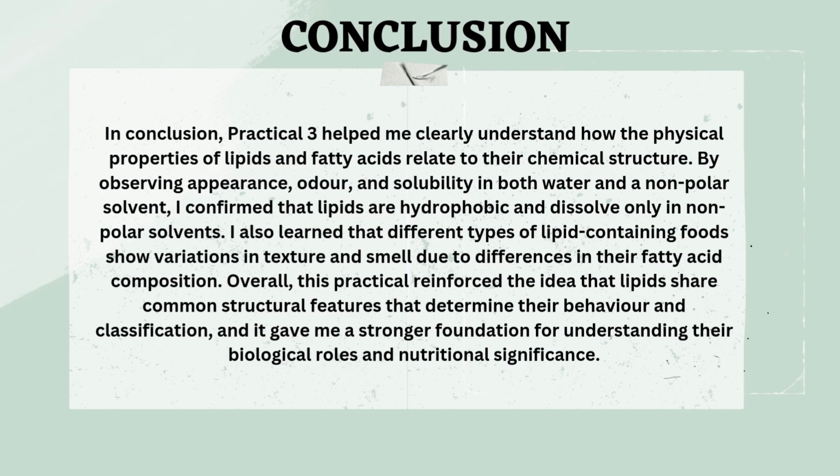In conclusion, Practical 3 helped us clearly understand how the physical properties of lipids and fatty acids relate to their chemical structure. By observing appearance, odor, and solubility in both water and a non-polar solvent, I confirmed that lipids are hydrophobic and dissolve only in non-polar solvent.